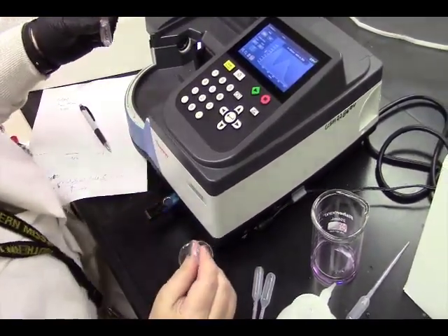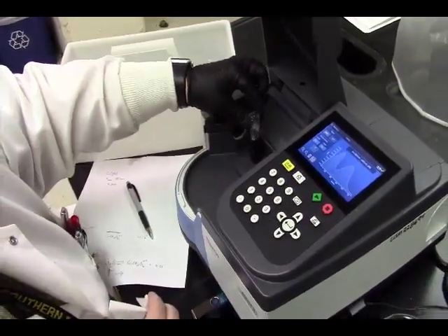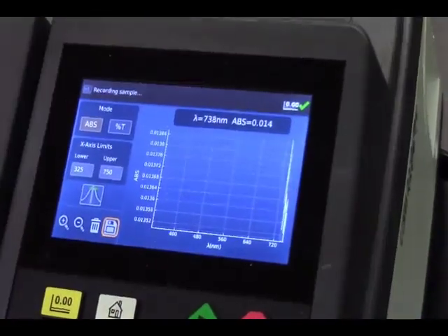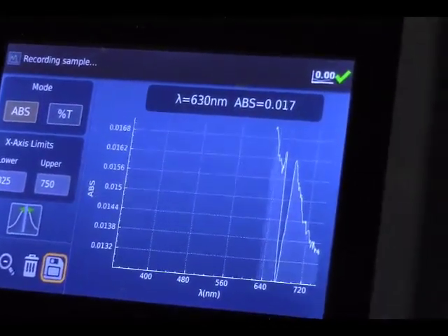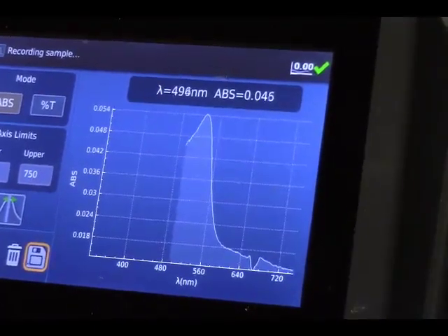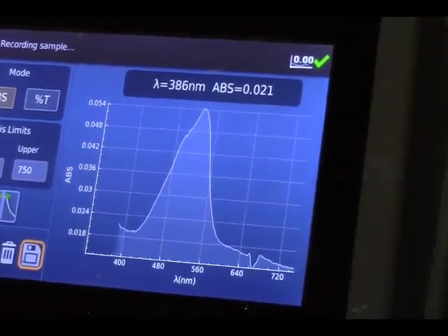That's such a pretty pink. This is the oxalate. Cobalt oxalate, which is C2O4, has a lambda max of, ooh, I don't know why it did that. It's weird looking. This is a little pink, so we would expect it to be a little in that direction.